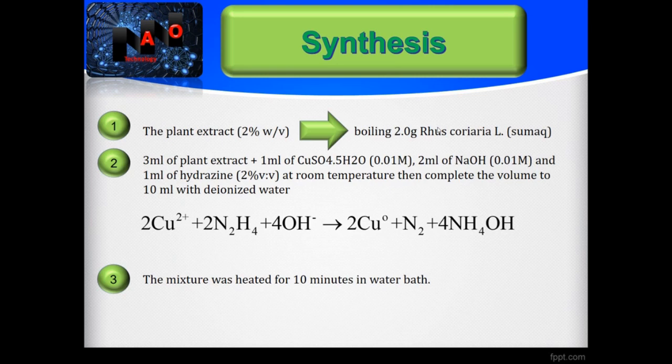The next step is synthesis of nanoparticles using sumac extract. To synthesize nanoparticles using sumac as stabilizer, 3 milliliter of plant extract were added to 1 milliliter of copper sulfate pentahydrate with the concentration of 0.01 molar.